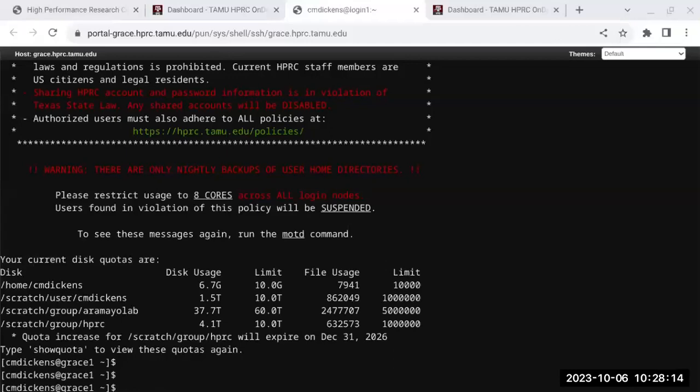All right, we have a number of tools available if you have a PacBio sequencing data set. Minimap2 is very popular. Canu is very popular if you're doing assemblies. And then Unicycler is good for bacterial genomes. Another one is really fast compared to Canu. It's accurate, but not as accurate as Canu. But you can get a good draft assembly very quickly, like 10 times faster than Canu, if you use WTDBG2. Flye is another popular one that's being used.